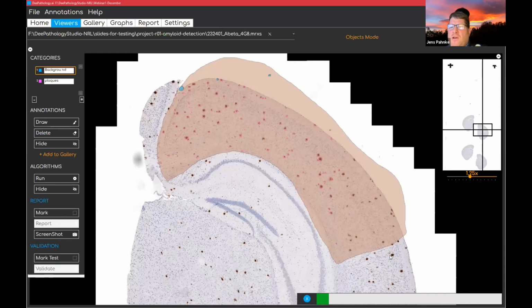So this is actually all. You have not to do anything more. You just go in, you annotate your cells, you annotate your objects, whatever you want to have. You start the learning mode, it's training, and then you have a look in between a few times whether the algorithm gives you a good response on what you have put in as objects and background.